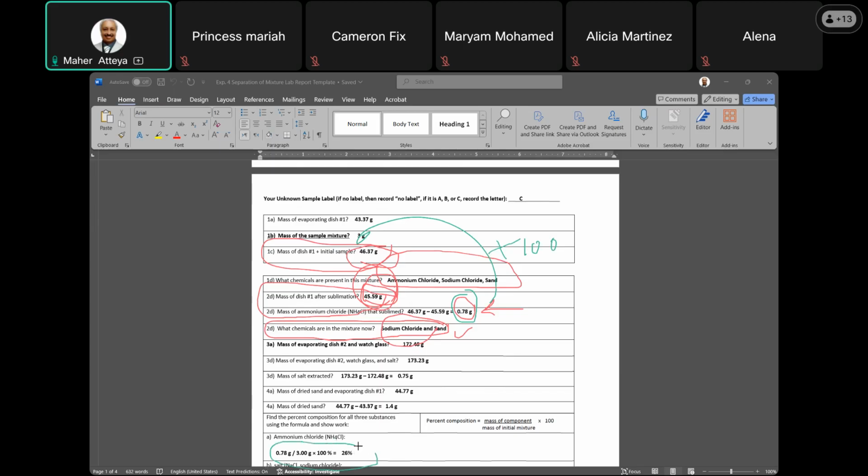And that's what I have here. Look, that's my sample, a percentage of ammonium chloride. After cooling, I get a mass. I subtract this mass from the whole mass with the crucible I started with, which is this number here. Again, circle it, this number here. That gave me this amount of ammonium chloride, divided by the original mass, which is here, multiplied by 100, gives me this value here. That's it, ammonium chloride is done now.